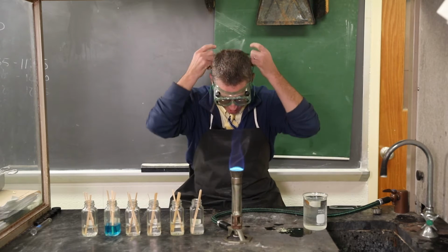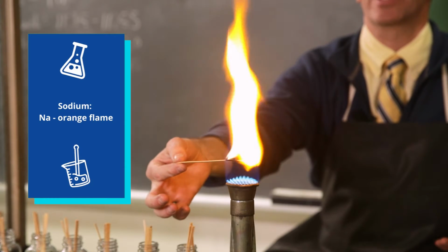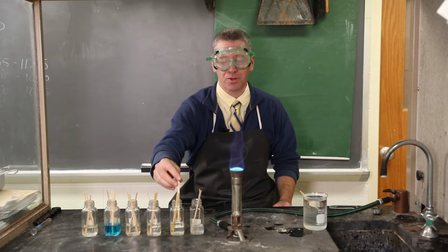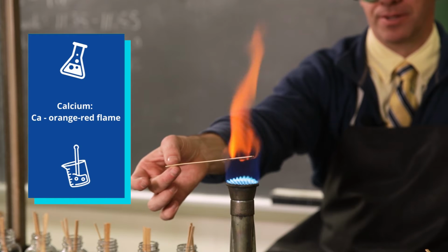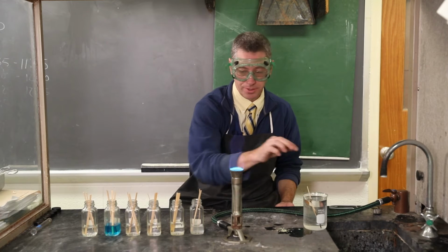The first thing we're going to do is very common. This is sodium. And this is the color that you see in parking lot lights. The next one is kind of similar. This is the element calcium. Now the bright yellow that you see there, that's the actual stick burning, not the element.